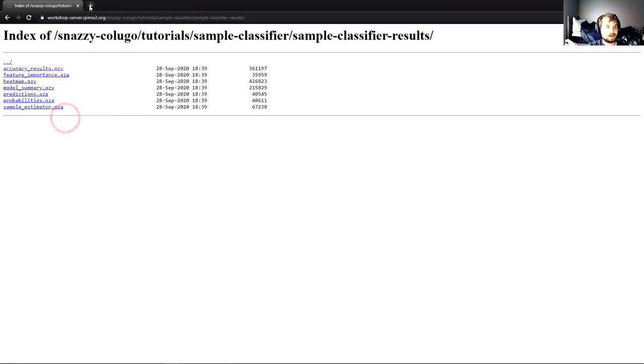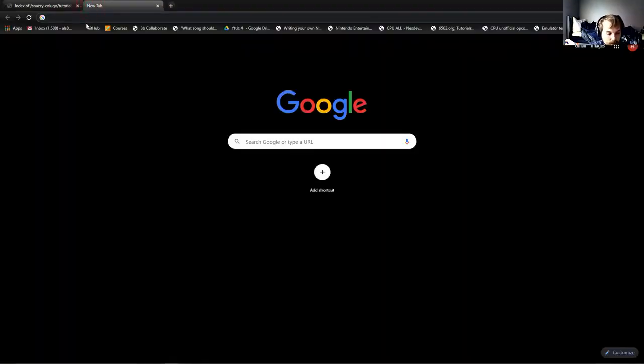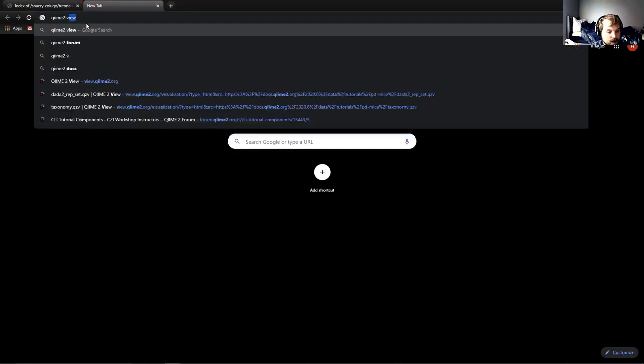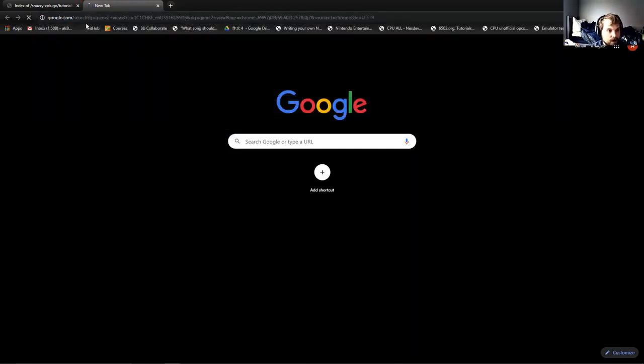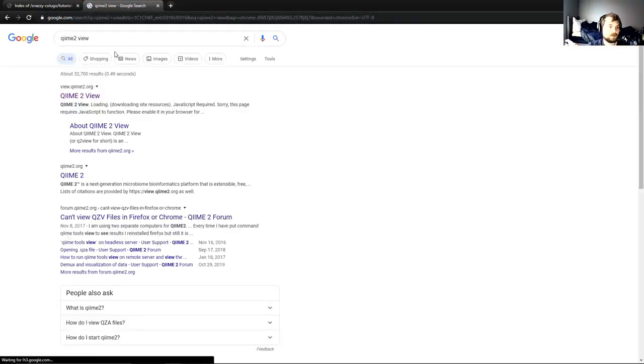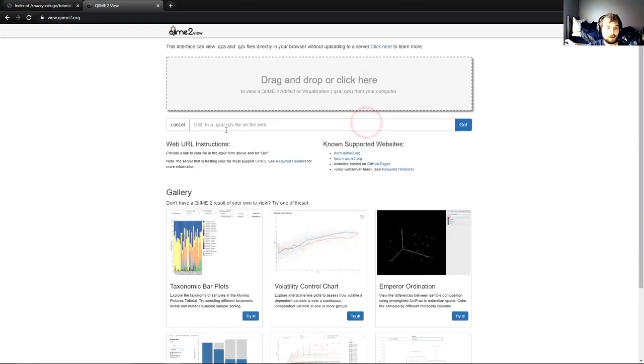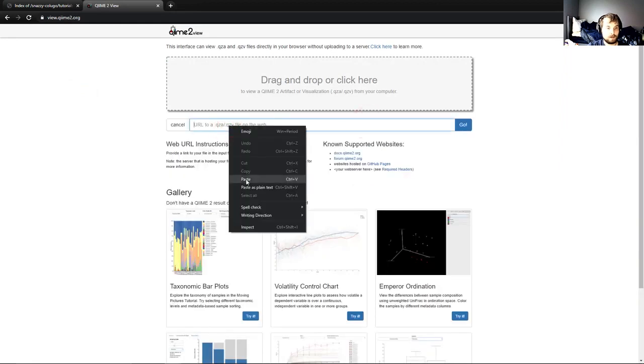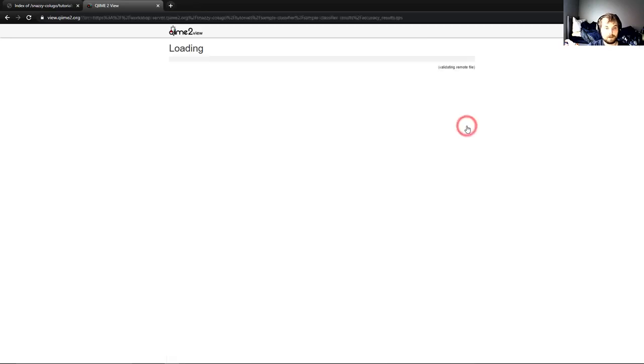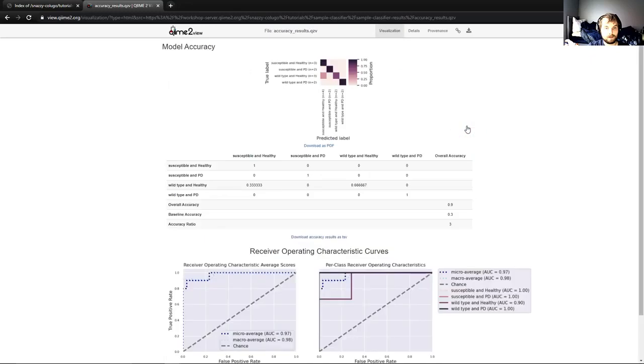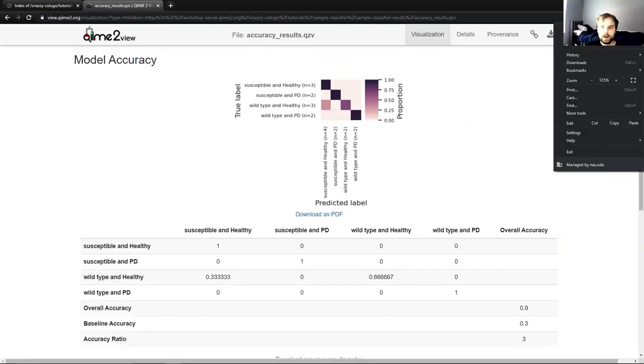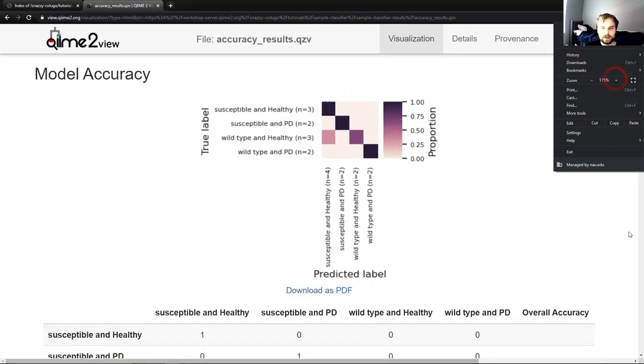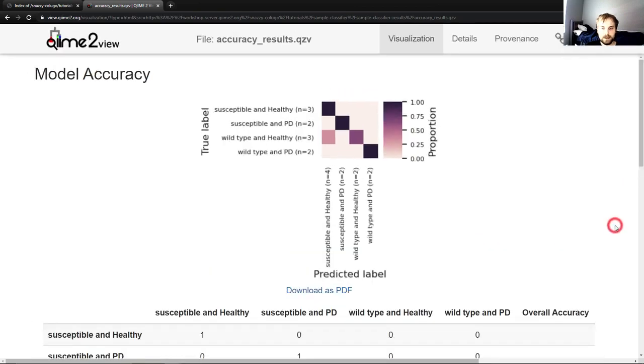And what we want is accuracy results. So I will right click on accuracy results, copy link address, open a new tab, look up QIIME to view, go here, view a file from the web, paste our address that we just copied into here, click go, and here we are. And I've already zoomed in a bit, but I'll zoom in a bit more so you can see this heat map well, because it's a quite small heat map.